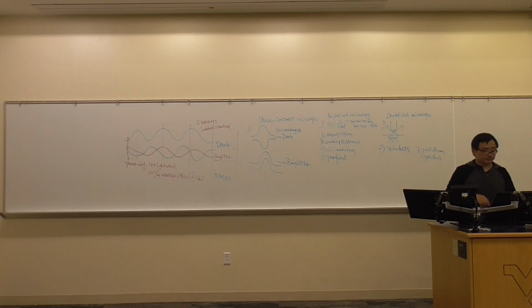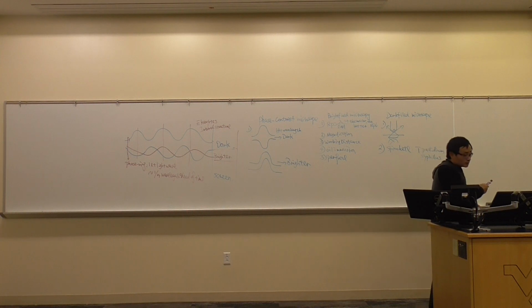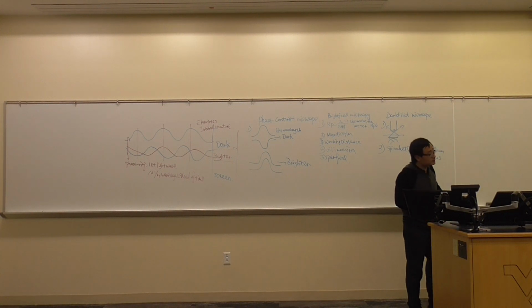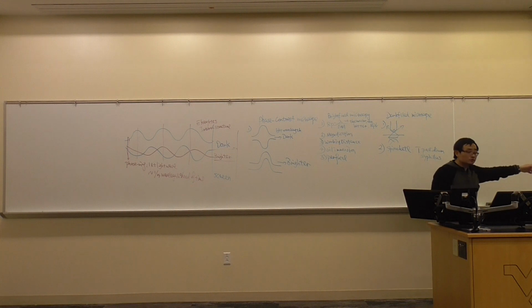And here, you can see the comparison between the bright field microscope, dark field microscope, and the phase contrast microscope. This is the yeast Saccharomyces cerevisiae. This is the yeast used for beer brewing. So when we manufacture beer, you need to add a yeast, which is Saccharomyces cerevisiae. And it's very interesting: under those different microscopies we just mentioned, which one would you like?